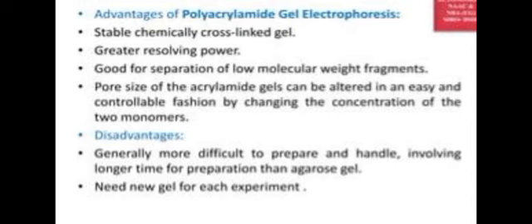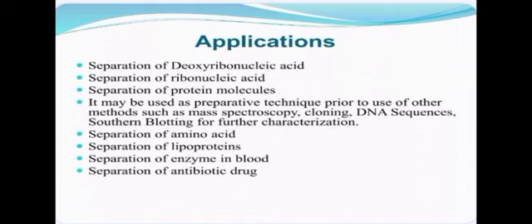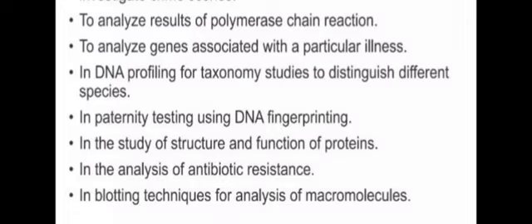Next the disadvantages: need new gel for each experiment, and generally more difficult to prepare and handle. These are the disadvantages. And next we see the applications of gel electrophoresis. Many applications in the pharmaceutical, genetics, proteomics, and research. These are the applications we see in this video.